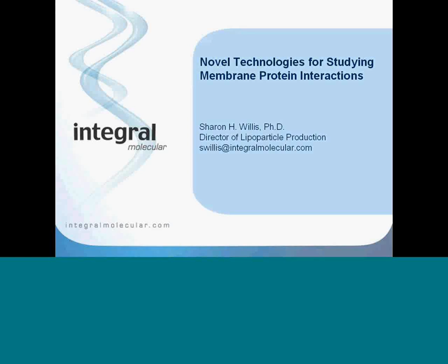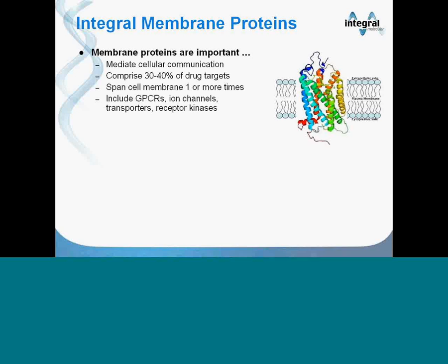So today I'm going to talk about novel technologies for studying membrane-protein interactions. Membrane proteins are important because they mediate cellular communication, and from a commercial standpoint, they're important because 30 to 40% of the drugs on the market today target membrane proteins. However, membrane proteins are often difficult to work with, primarily because their structure is dependent on the lipid bilayer. And trying to study them outside of the context of the lipid bilayer is a tricky and often empirical process.